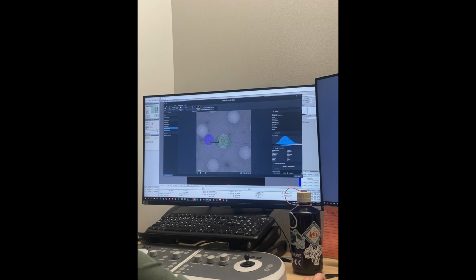Now, looking at the actual grid holes themselves, this is just an image. You also see the steering rig that you use for the microscope down there at the bottom. There's hundreds of these circular cutouts in one grid square, and there's many grid squares on one grid. Basically what we're doing here is labeling specific grid holes for collecting data afterward.